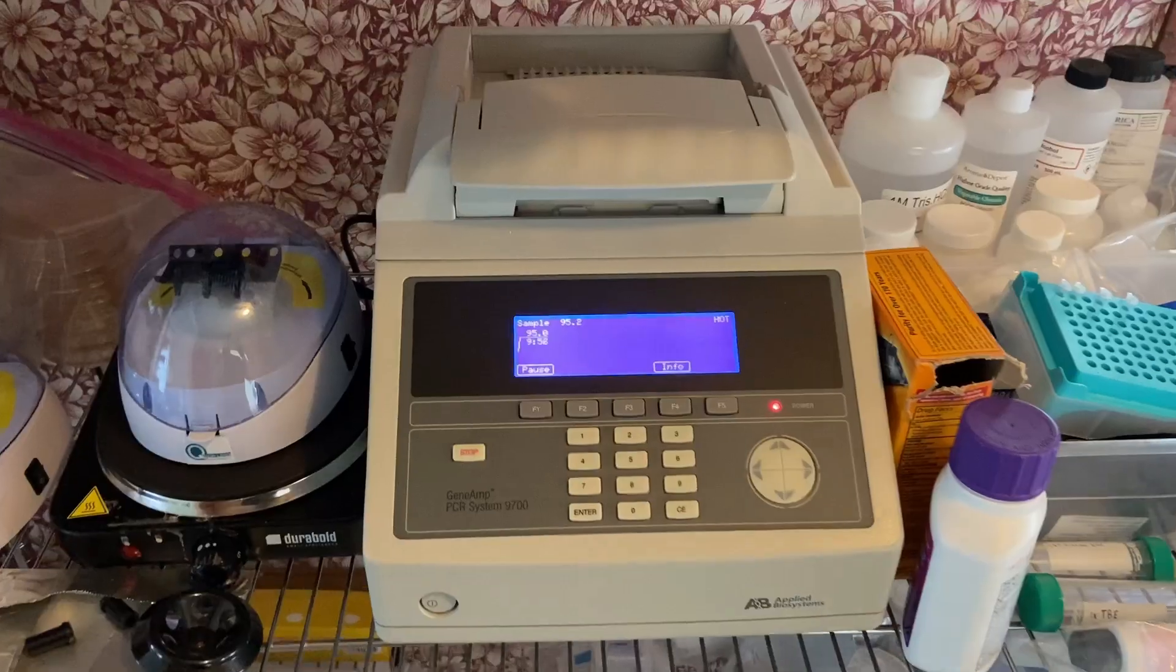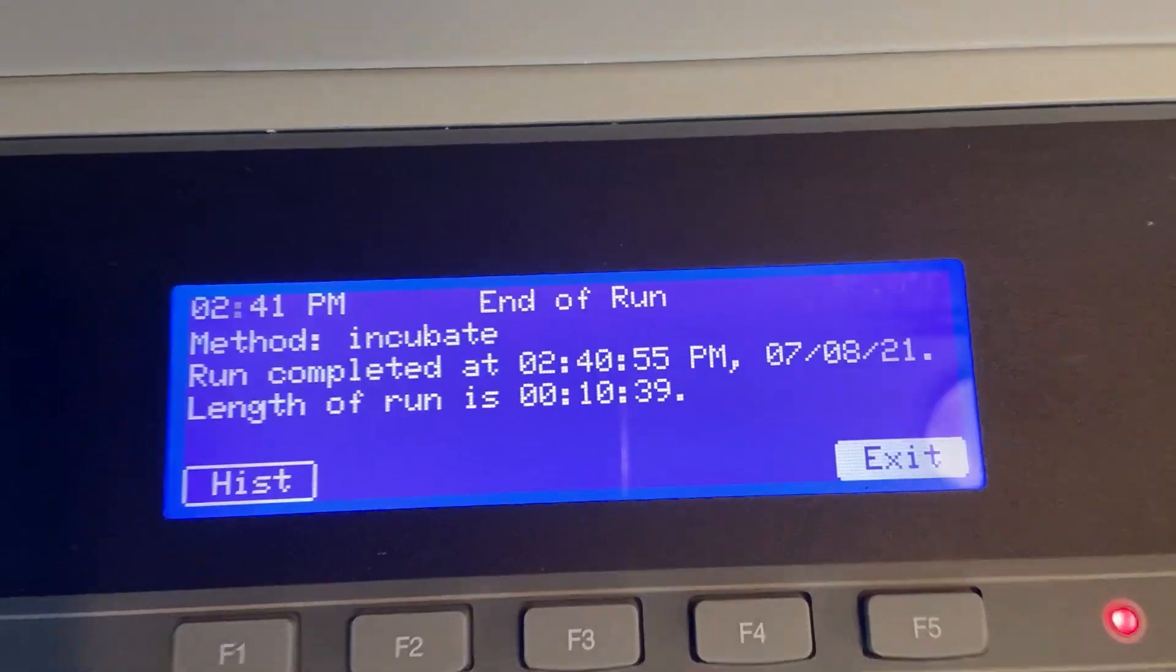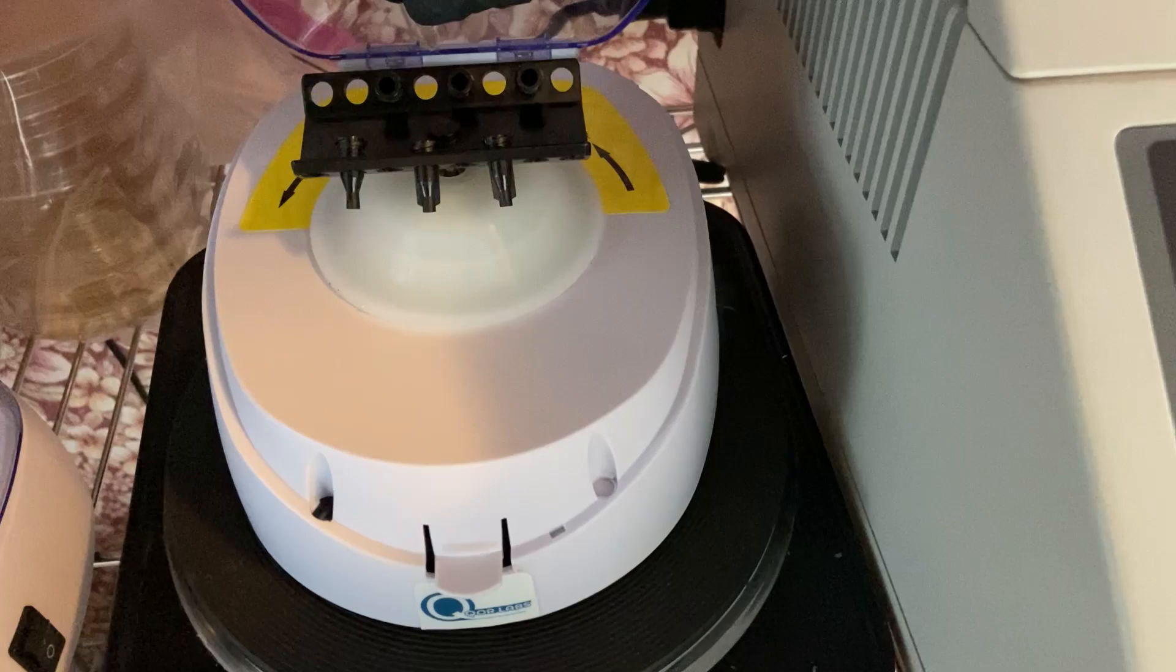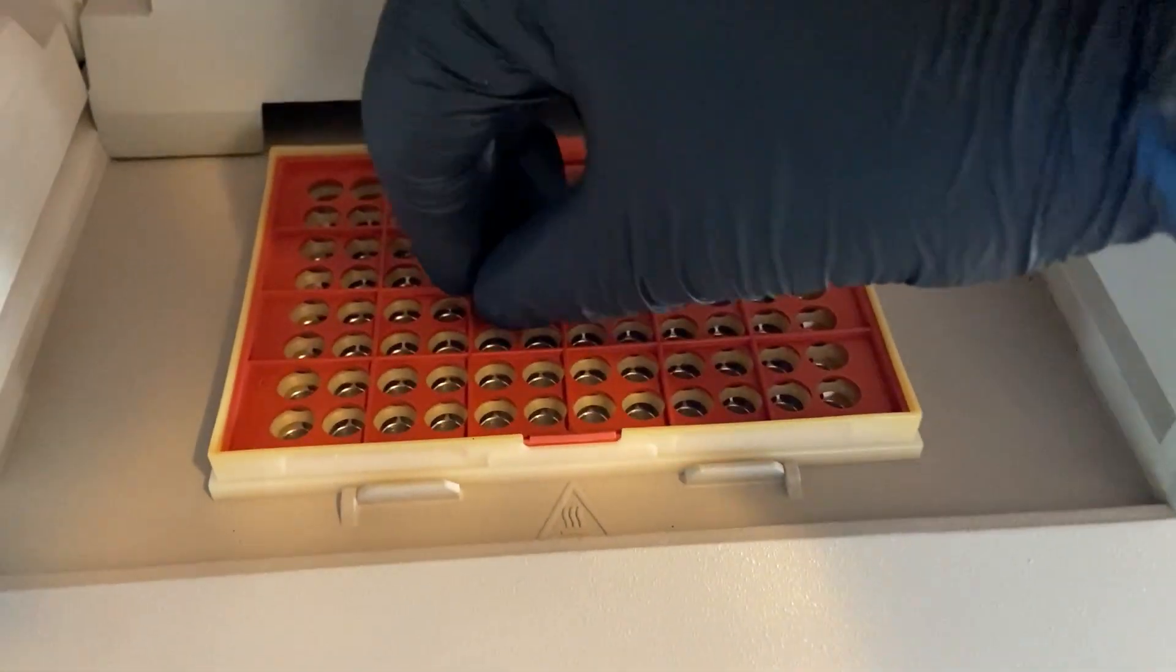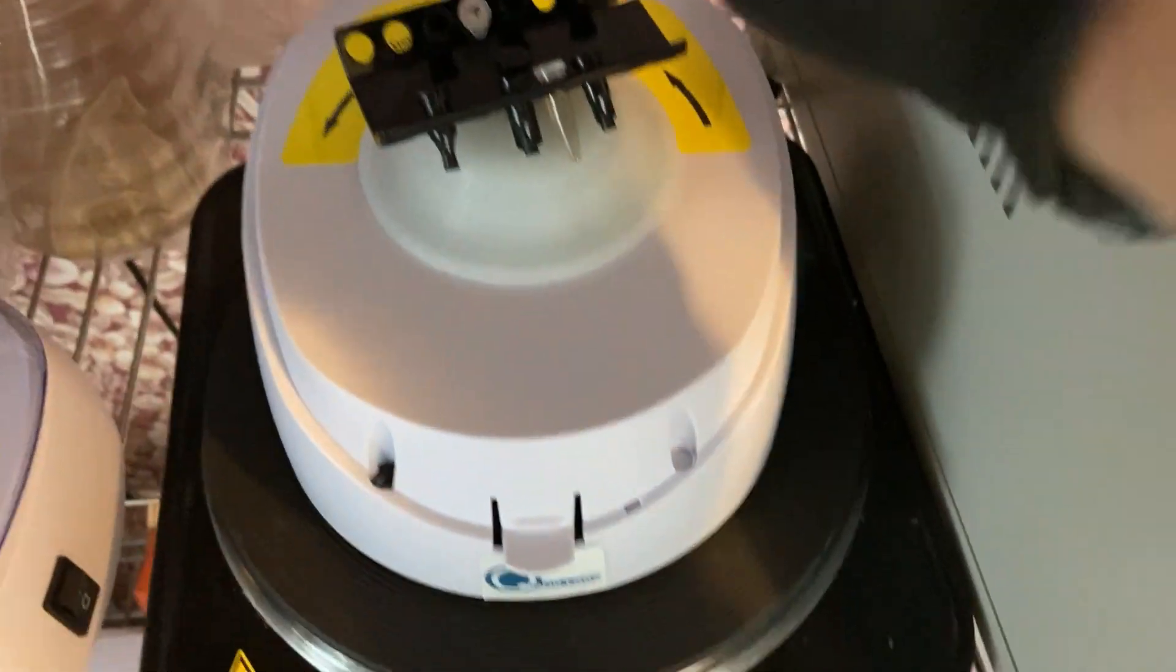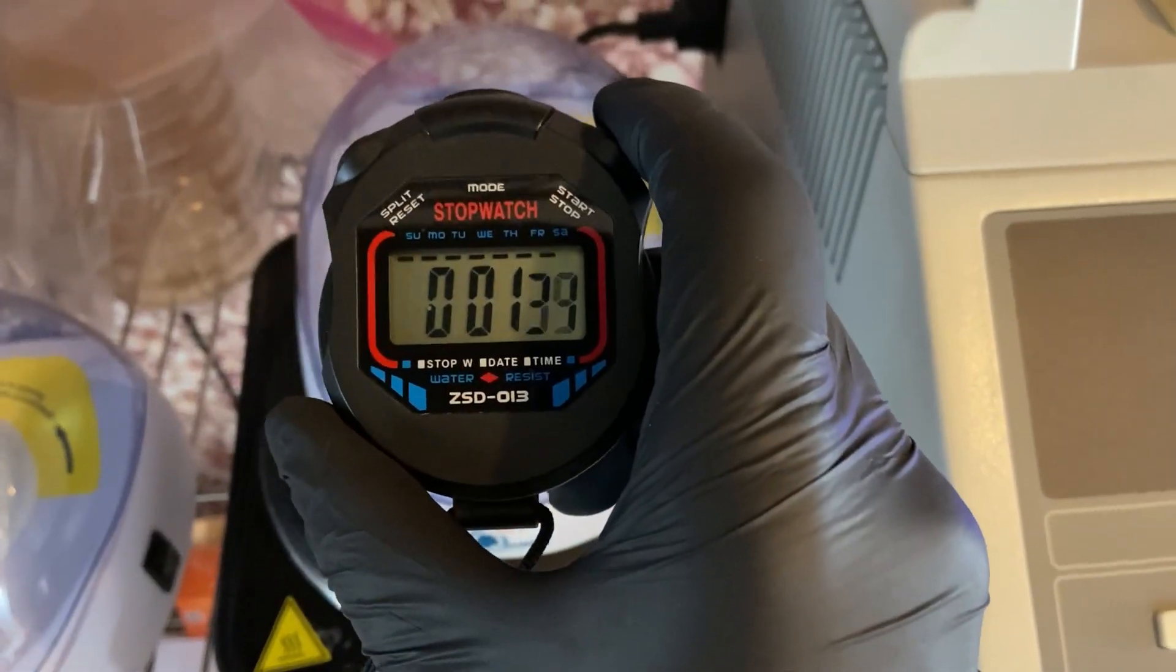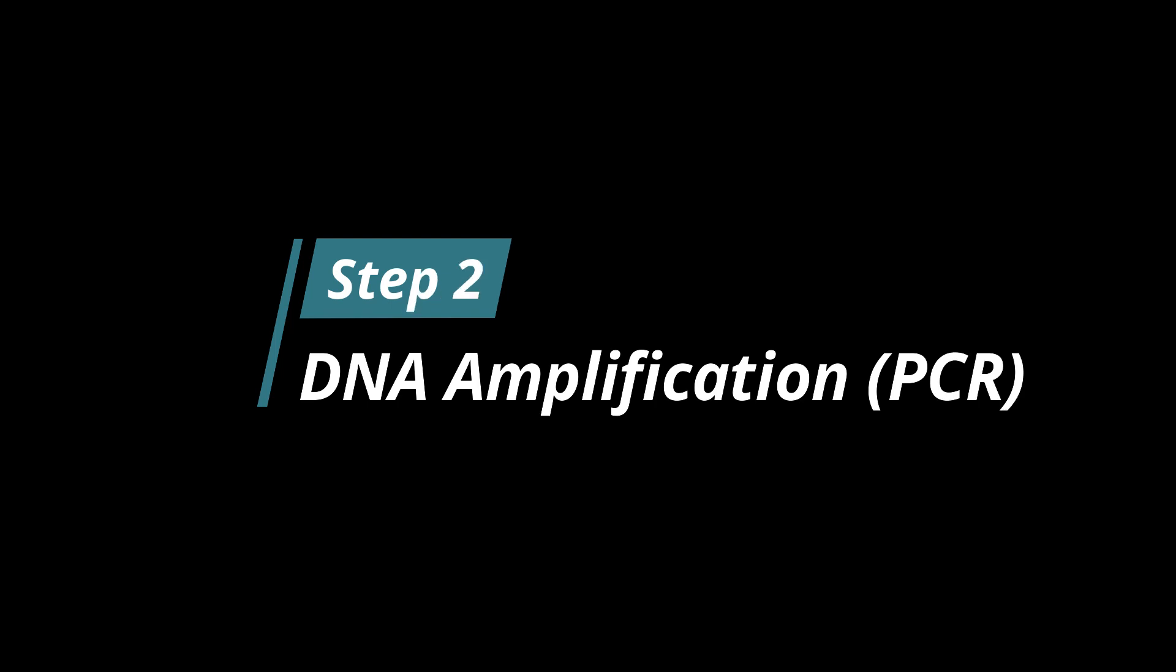And just a quick note about thermocycler. This is one that I picked up on eBay for about $250, maybe $300 shipped. You should be able to find some on eBay. There are other options, open source alternatives that you can buy. But it's important if you do get one, make sure that it works, make sure that it has a warranty, and make sure that you get one that has a heated lid. You'll notice that when I started the incubation period, the first thing that the thermocycler does is heat up the lid. And that's important to managing the condensation that forms on the top of the lid. And that can have a big impact on the results of your PCR reactions. So we're going to go ahead and let these spin down for five minutes. And then we'll move on to the next step, which is the PCR process.